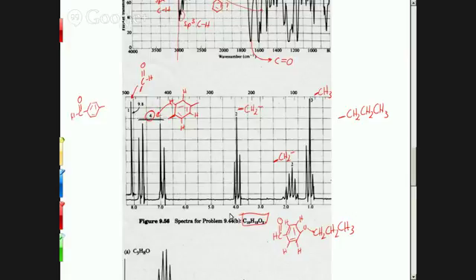Okay, I have a question. You have to split that. Well, we split it, but really it's all kind of in the same range. So when you look at your structure, you may be able to see, hey, this one hydrogen could be closer than this other, but probably not. So it's your 4 hydrogens.